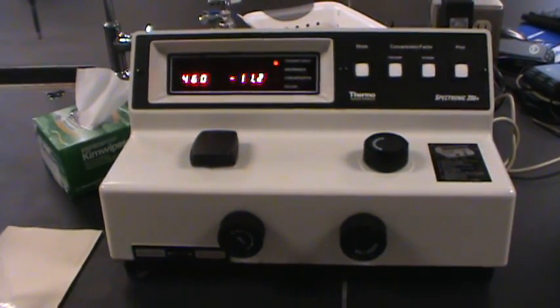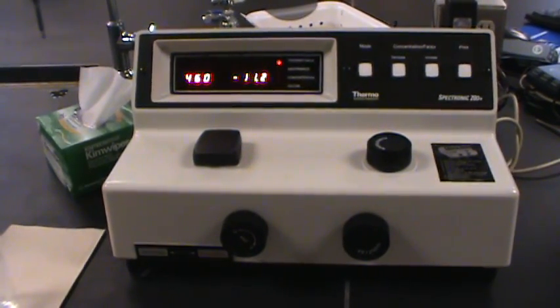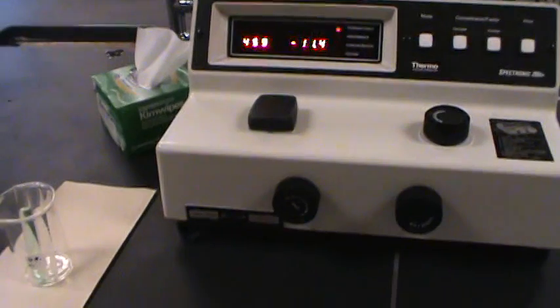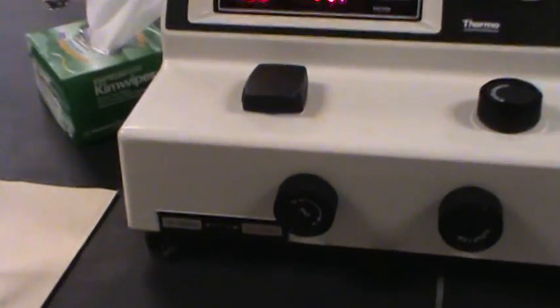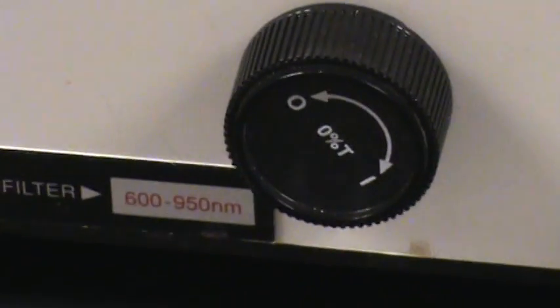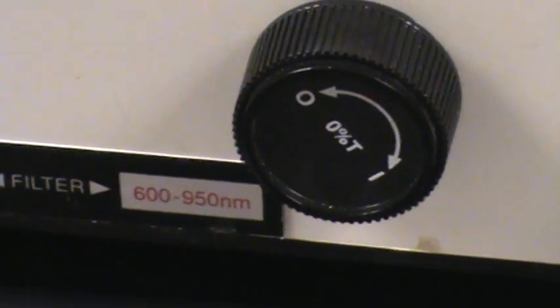So while this is warming up let's just take a quick look at some of the controls. So again we've got our on off and zero percent transmittance switch.